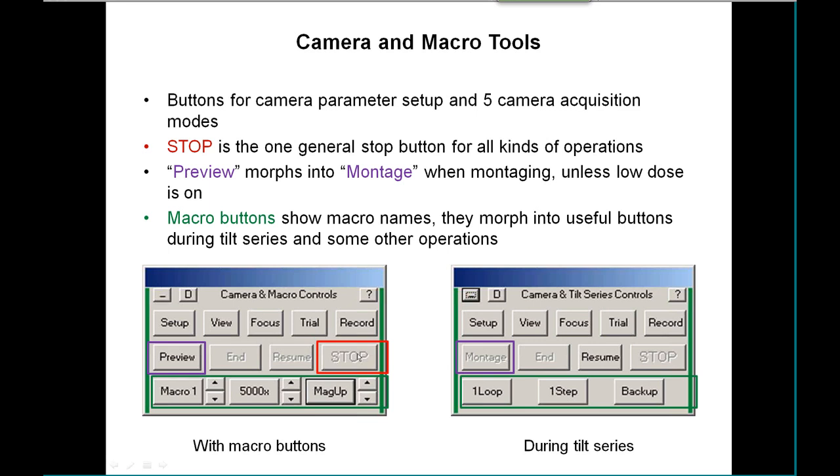The stop button is a general purpose stop button that will stop all kinds of operations, except image acquisition is hard to stop sometimes because you've told the camera to go off and do something. This preview button will morph into montage when you montage, unless you're in low dose where preview is more important.